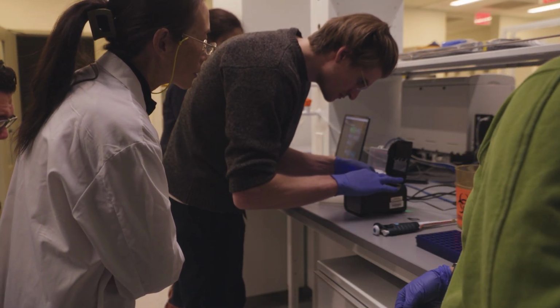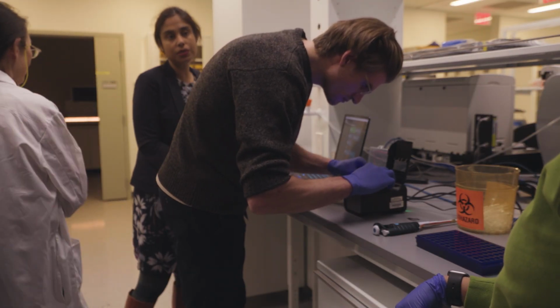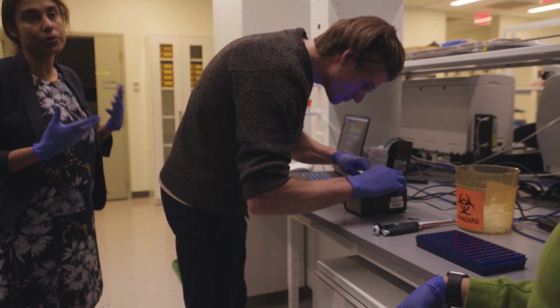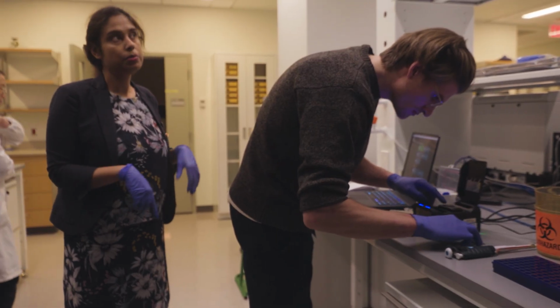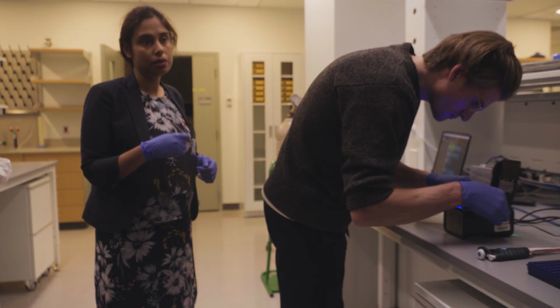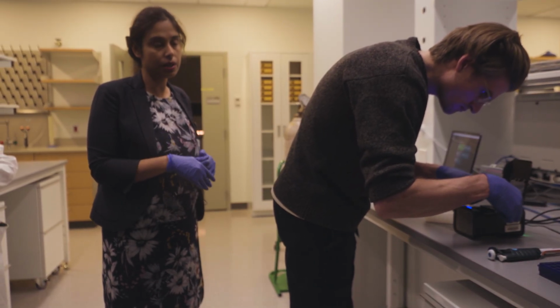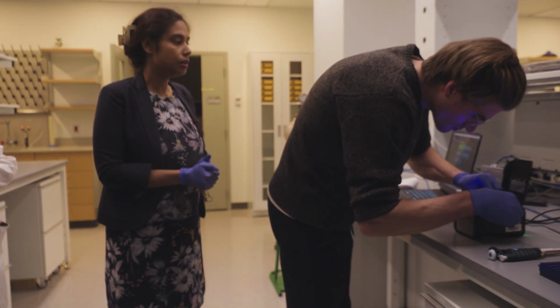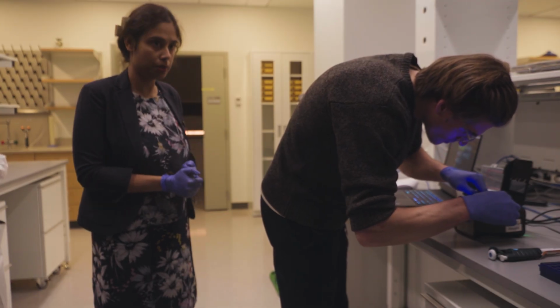Why do we need the light shield? I think presently there is no bleaching or anything. The current chemistry, the nanopore you are using now, is called R10. Previously we had R9, and I think there was some kind of photo bleaching. So it is just for safety, but presently I think they say it is optional. Okay. With R10 chemistry, but it's the recommended one. We'll just do it.